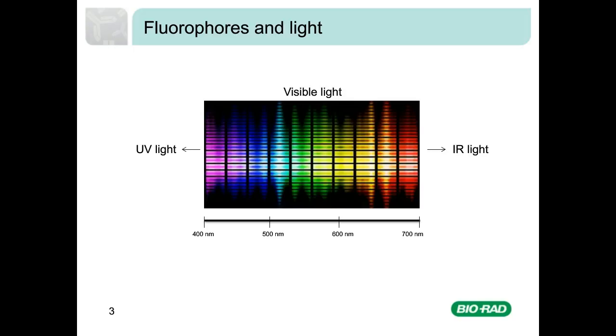Flow cytometry relies on fluorophores attached to antibodies to detect markers of interest both from the cell surface and intracellular. Fluorophores are molecules that accept light energy at a given wavelength and rapidly emit this light at a longer wavelength. In flow cytometry, the light source is most often a laser, or now more commonly multiple lasers. The filters and detectors, called PMTs, in a flow cytometer will allow light from around 380 to over 800 nanometers to be detected.